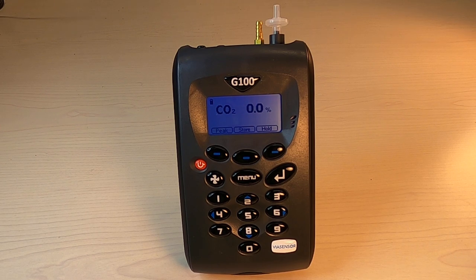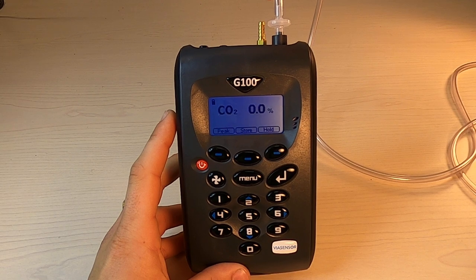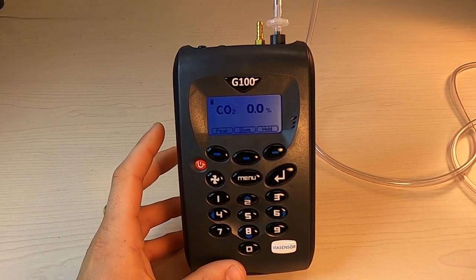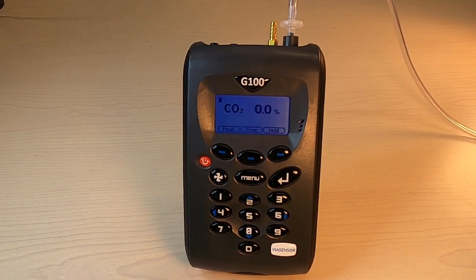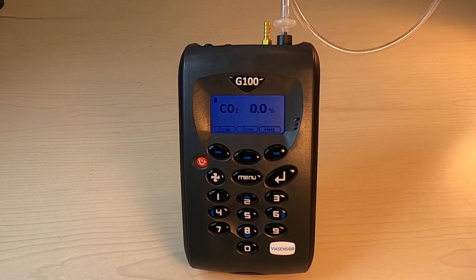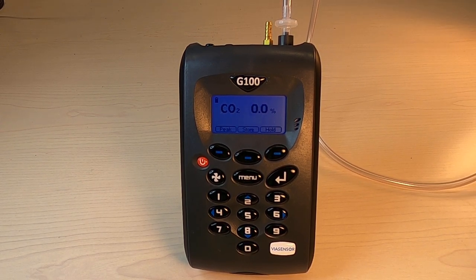Once you're ready to take your reading, you connect your sample tube to the sample filter, just as such — not over-pressing it to protect the inlet port. Then run the other end of your sample tube to wherever your sample is.